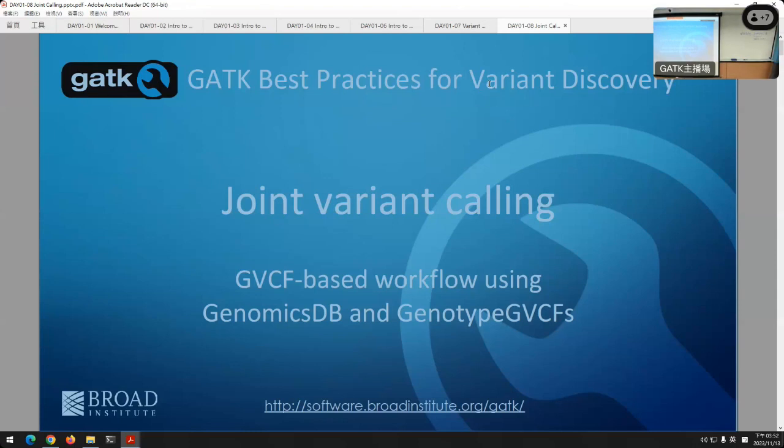We're going to cover joint variant calling now. Last time in our hands-on exercise, we covered using HaplotypeCaller for individual samples, looking at the calls, examining the BAM files, and examining some of the internals of what HaplotypeCaller was doing when it realigned some of the soft clipped reads, basically seeing how we can get more confidence in calling at the single sample level. We barely touched on joint calling when we used GenomicsDBImport last time, but I'm going to focus much more now on that process.